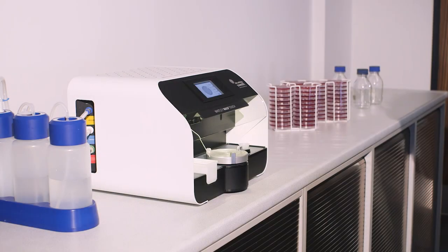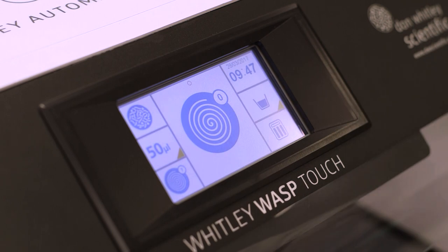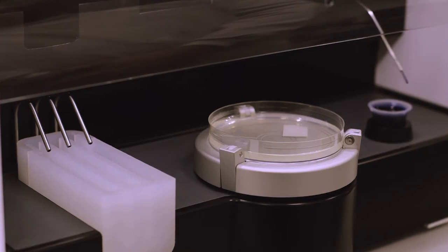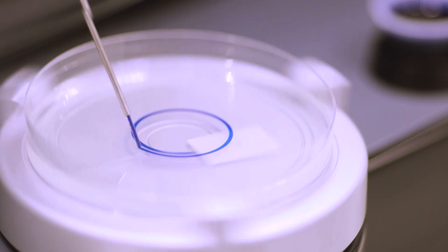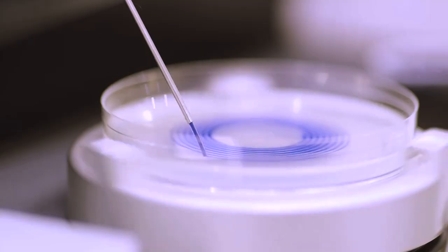Wasp Touch has many unique features to provide simple operation and reliable performance. The touchscreen system ensures that sample processing is straightforward, whilst detailed logs of date, time and number of plates produced provide complete traceability.